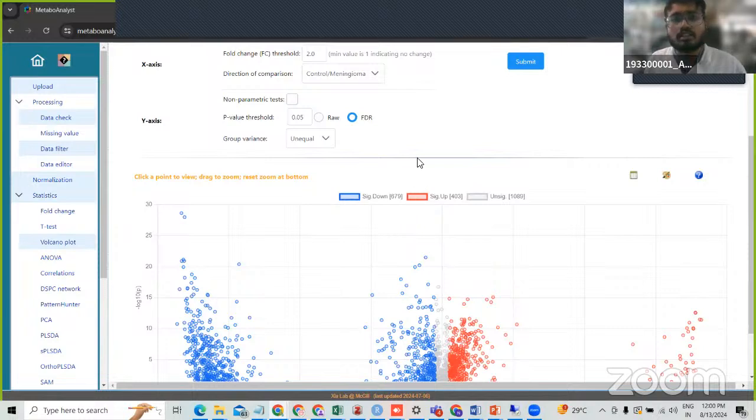Yeah, so this was a quick overview of the data analysis for the mass spec data. Of course, there is a lot to be done in this area. In fact, we spend maximum time analyzing data. Data acquisition is very easy, but what is most important is data analysis and making sense of the data, right?